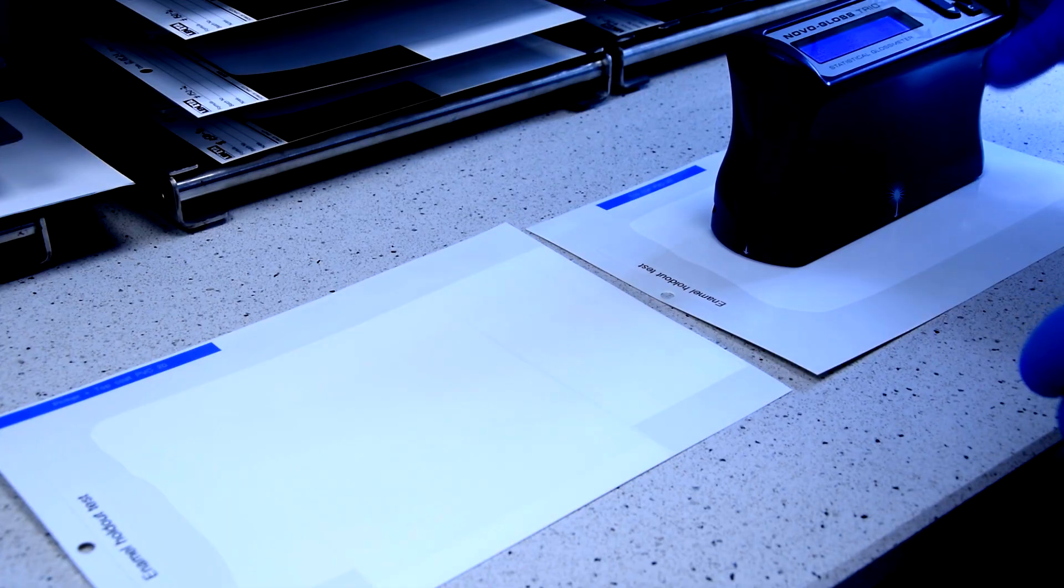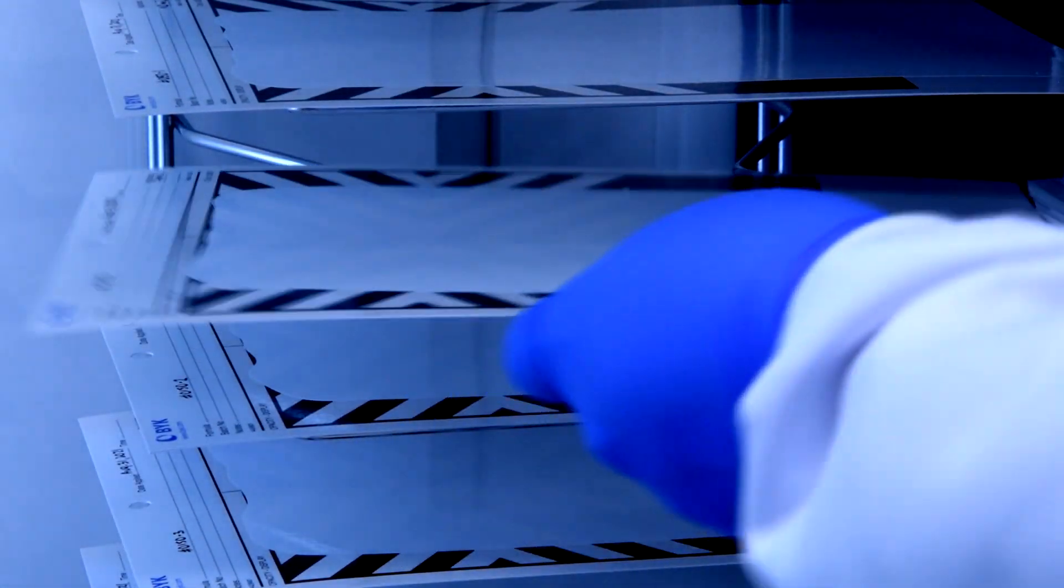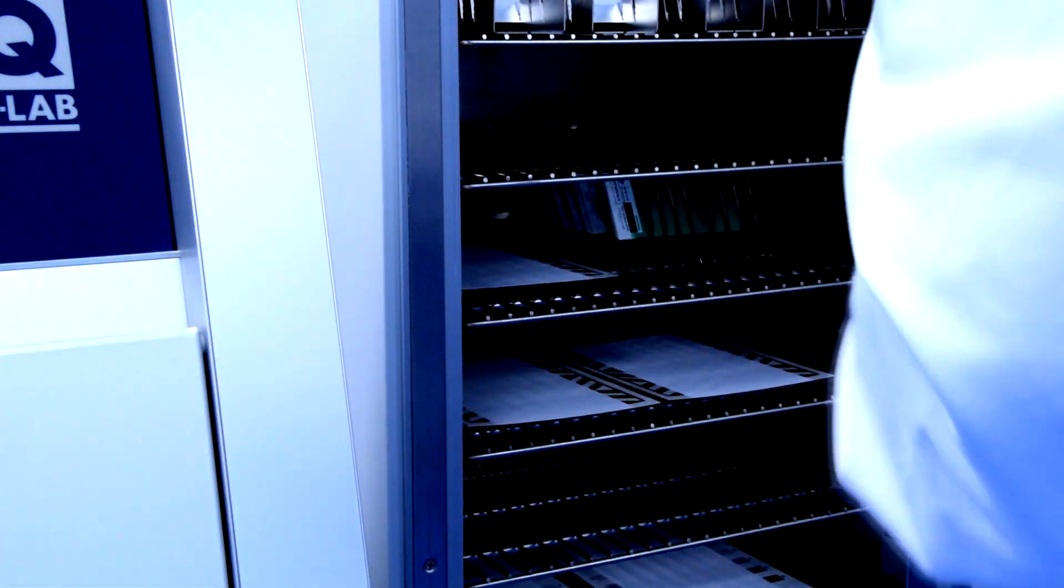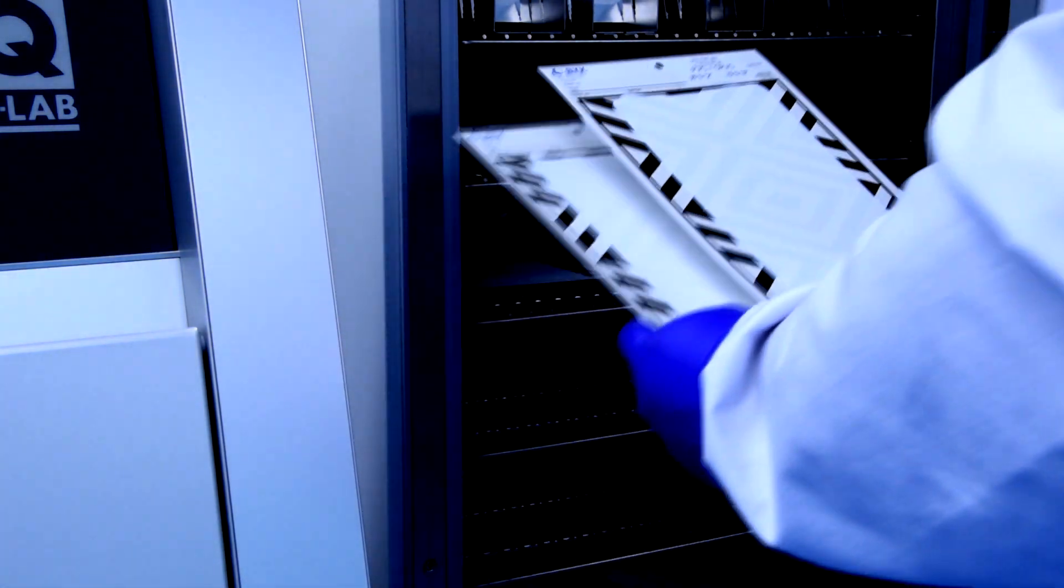In the field of raw materials tests carried out in our lab in primers and undercoaters, there are all raw materials for the formulation of waterborne architectural primers, from pigments through titanium dioxide substitutes, fillers, additives to polymer dispersions.